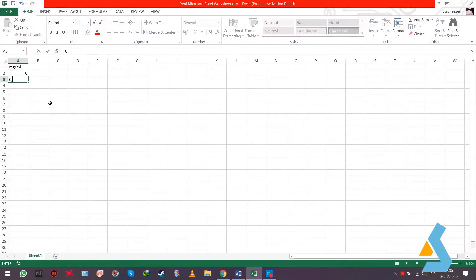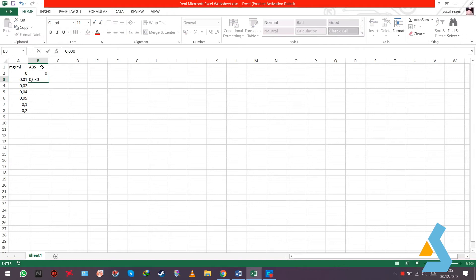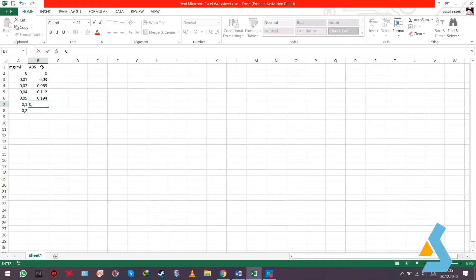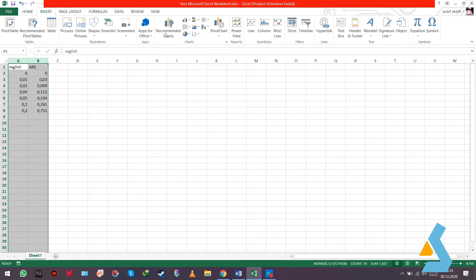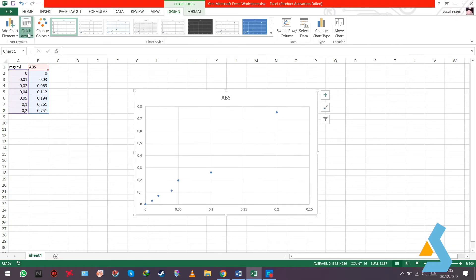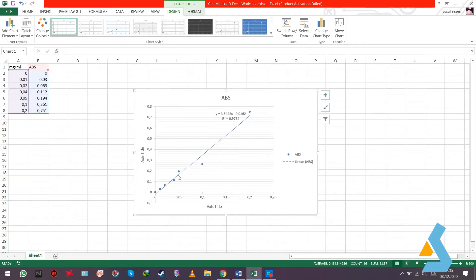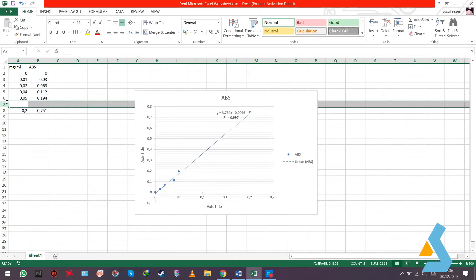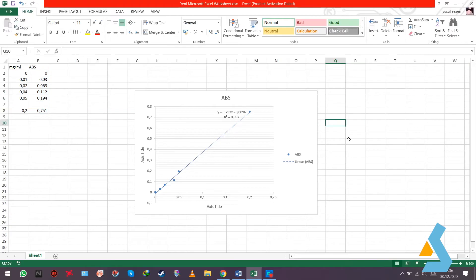We open an Excel sheet and enter the concentration of the glucose samples and the absorbance values. We generate a dot-plot graph and find the linear curve and its equation. To increase the correlation coefficient, we can eliminate the outlier value.